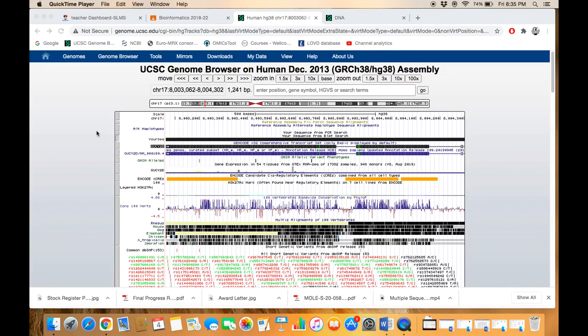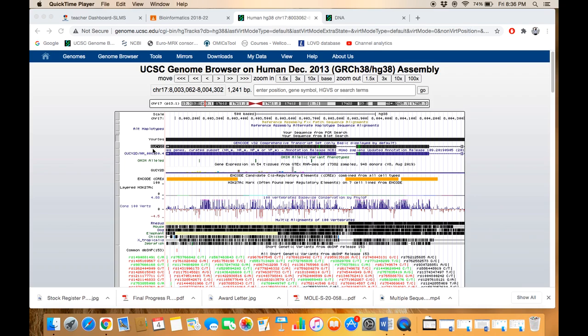Here we are on the result page of BLAT. Primarily, you can confirm that the query sequence you just pasted belongs to GUCY2D. You can see this GUCY2D gene is actually present on chromosome 17. Physically, it is located on the short arm of chromosome 17, band 13.1.